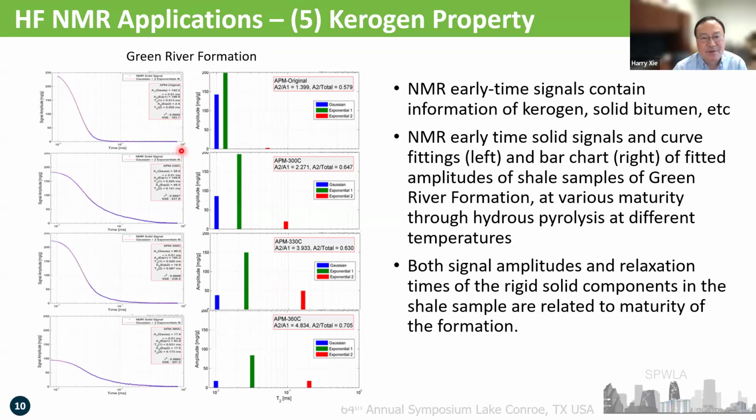And the reason for its multiple components is because it has multiple components. For example, we're talking about the kerogen, which these two represent. If you study chemistry, you probably understand that in kerogen you have two different chemical groups. One is more mobile than the other. The more mobile ones don't move around, they do this rotational motion. One's called aliphatic, the other called, I forgot the name again. So two different molecules, and you can use the blue and the green to describe it.